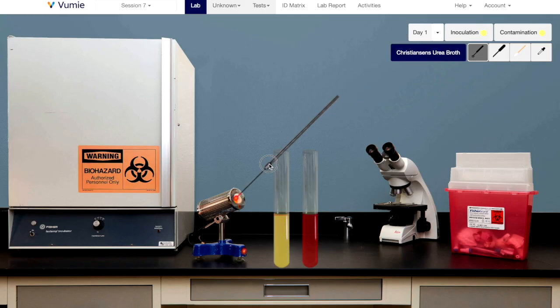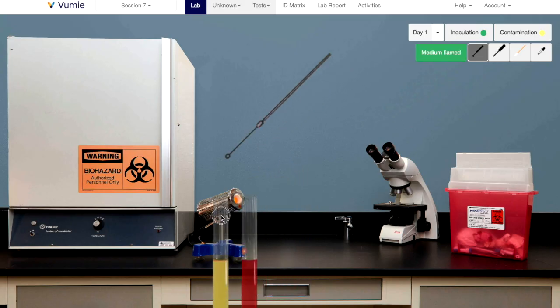Flame the transfer tool to prevent contamination. Then flame the mouths of the tubes. Look for the message indicating that this has been done.